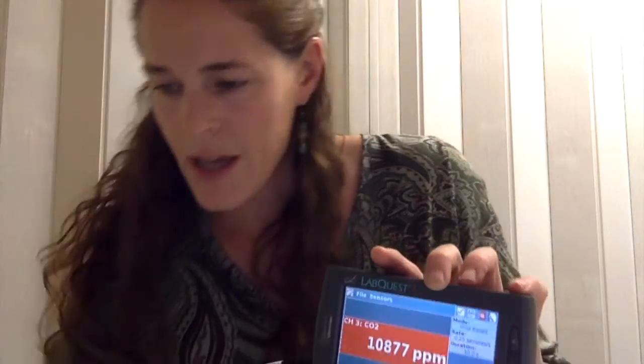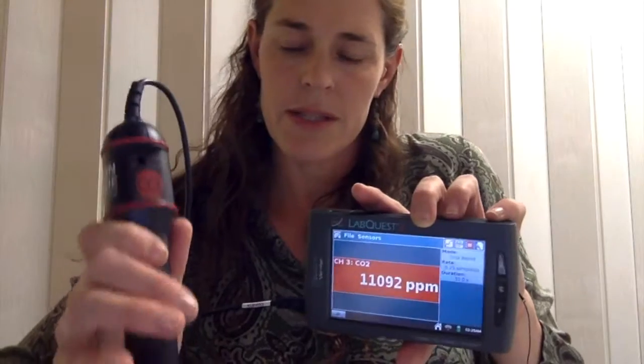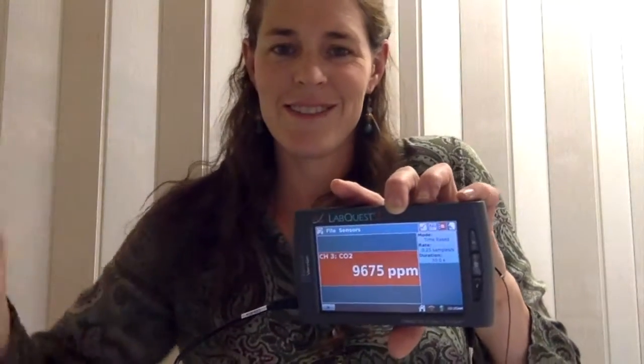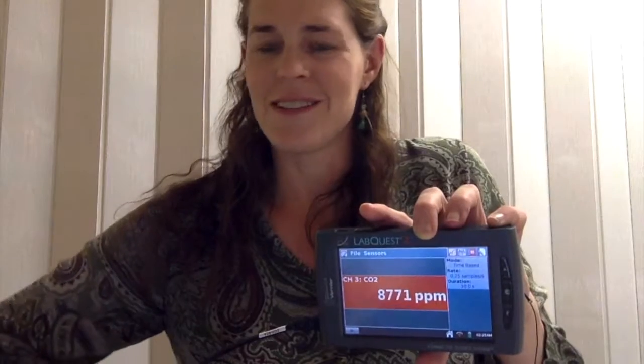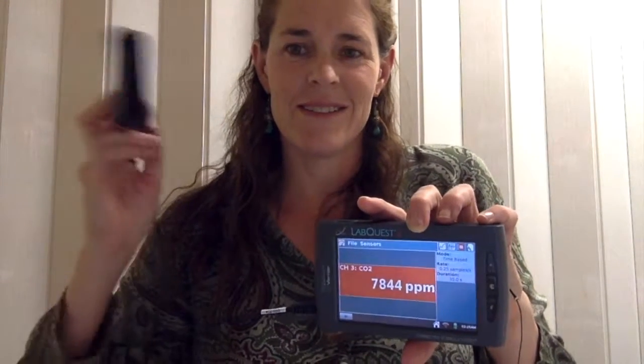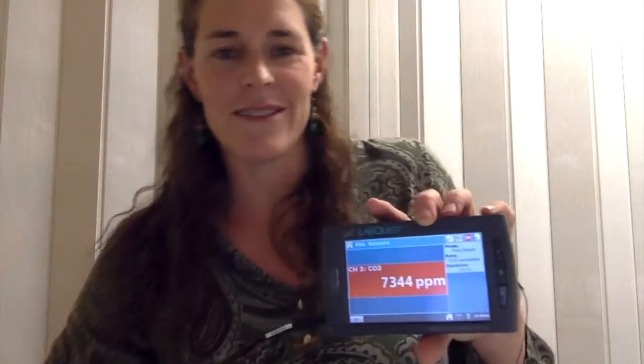Okay, so we're going to press okay, and I'm going to take this out again and give it a little bit more air, more oxygen. You can see this is still pretty high. It's going down. All right, well, just so you can see it, let's go to the graph mode.